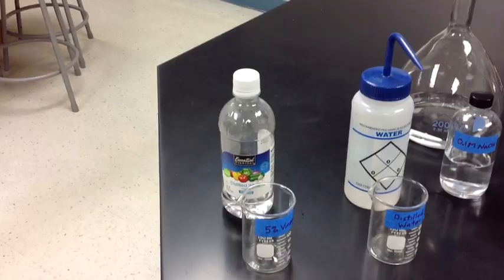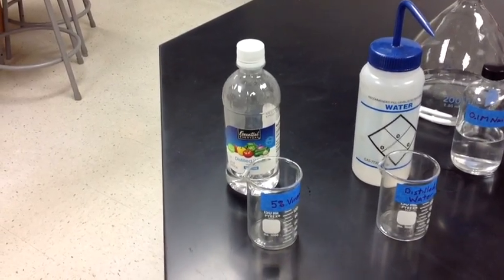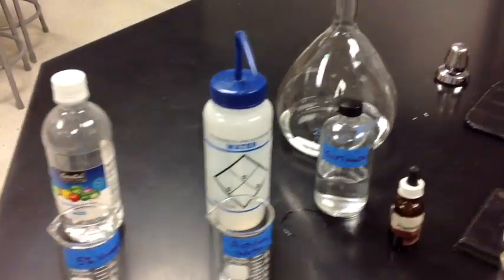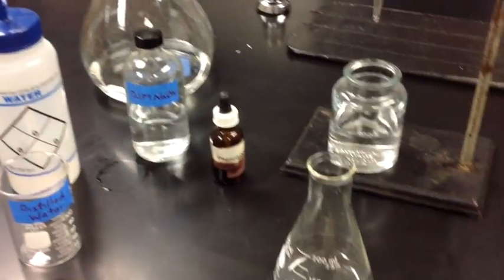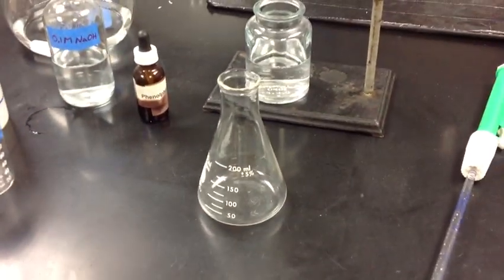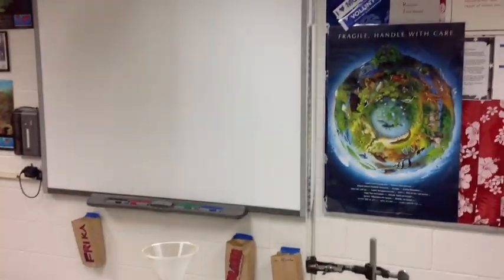Today we're going to do a titration of vinegar. We have a 5% vinegar solution, distilled water, a 0.1 molar sodium hydroxide solution, phenolphthalein indicator, an Erlenmeyer flask, and our burette tube filled with sodium hydroxide.